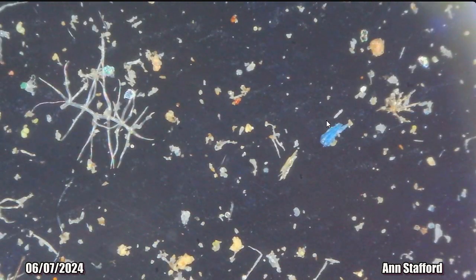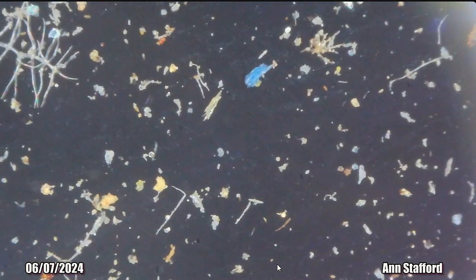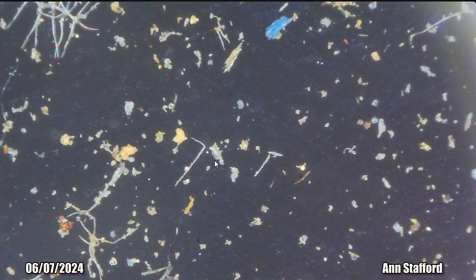And yeah, in this video today I'm going to be showing a lot of the little new hydra forming, like this little clear bit right here. Let me get it in. Where'd it go? Okay. This little clear bit right here. It's got little buds growing off of it. All of these little bits, if you notice, have little buds, little tentacles growing from them.